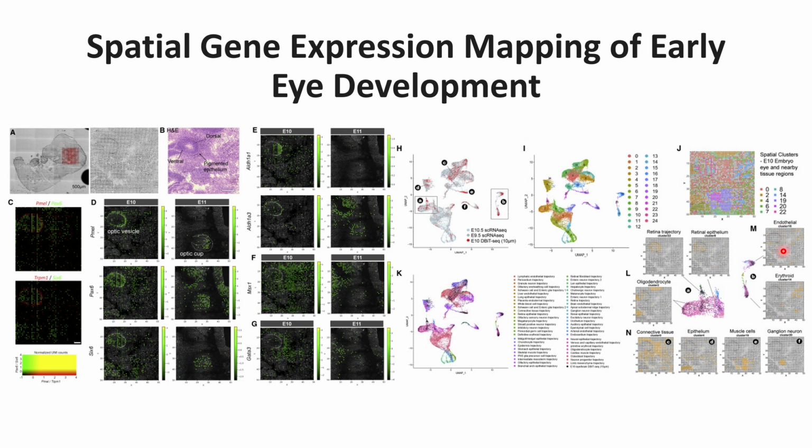On the B part, we can also see that these endothelial and erythroid clusters are formed, and respectively they also did D, C, E, F imaging, and they can find the different parts of the eye development. It is connective tissue, epithelium tissue, muscle cells.